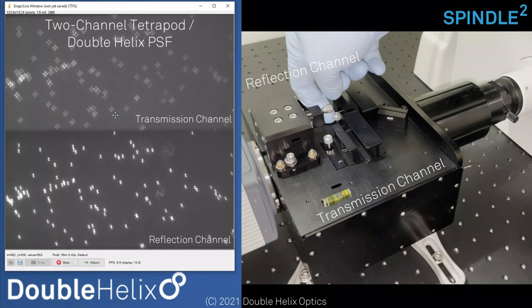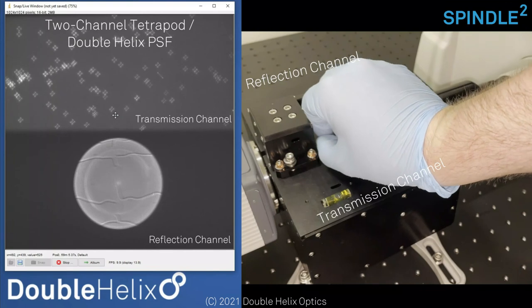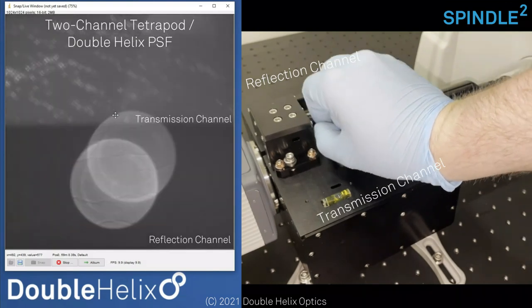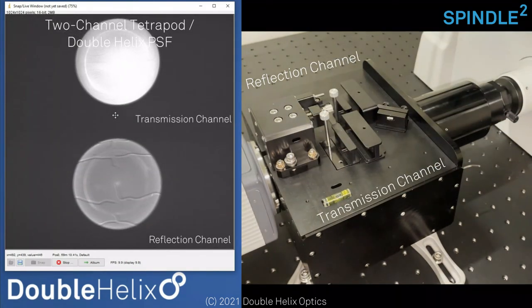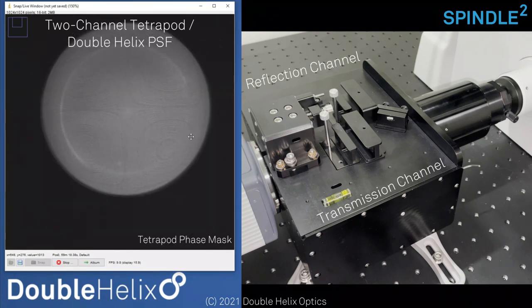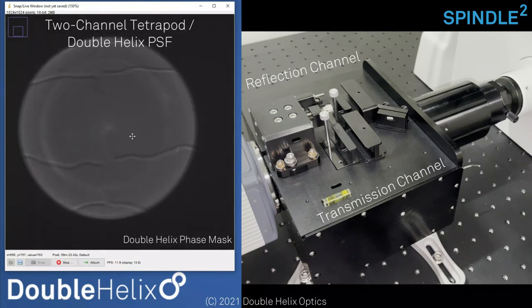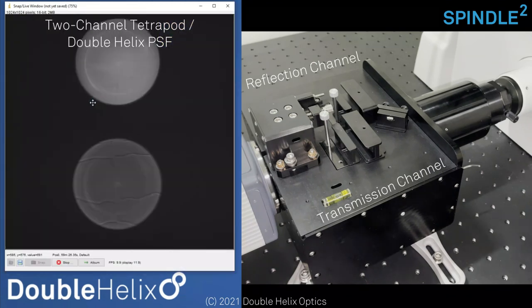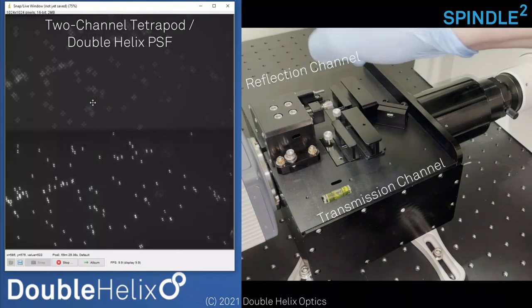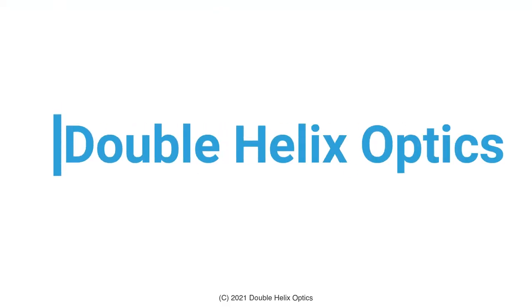We have alignment lenses in both channels, so I can just pick these up and on the screen you should see our two phase masks: tetrapod on the transmitted side and double helix on the reflected side. Having those built-in alignment lenses really eases the alignment burden. Those are the main features we have in our two-channel mode.